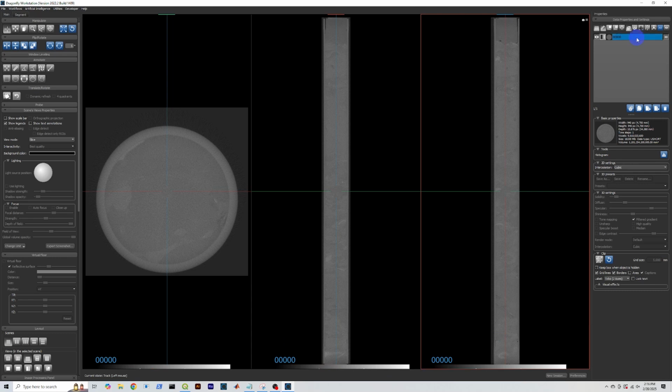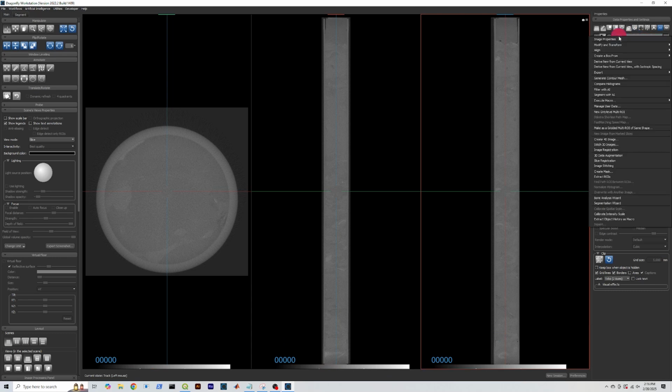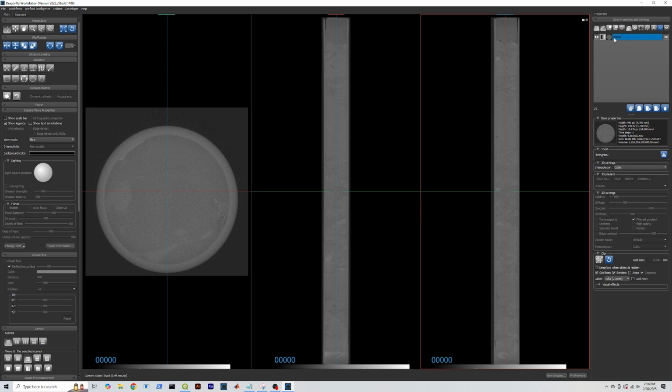Here in the Layers tab, we can see our core. I wonder if we can rename it. We probably can if we want to, but it's currently the not very descriptive 00000. Okay, let's go over to window leveling and make some first pass changes.